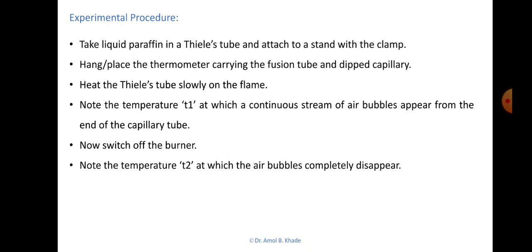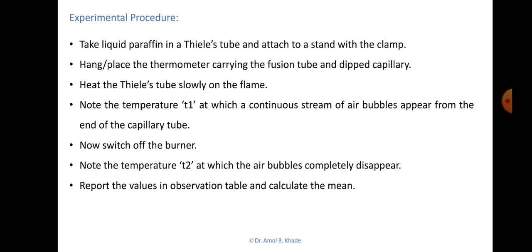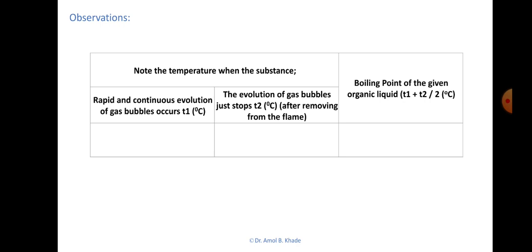Once you observe a continuous stream of air bubbles, immediately switch off the Bunsen burner. Then note the temperature T2 at which the air bubbles from the capillary end disappear. Record T1 and T2 in the observation table: T1 is when rapid and continuous gas bubble evolution is observed; T2 is when bubble evolution just stops after removing the flame. The boiling point is the mean of T1 and T2, i.e., (T1 + T2) / 2.